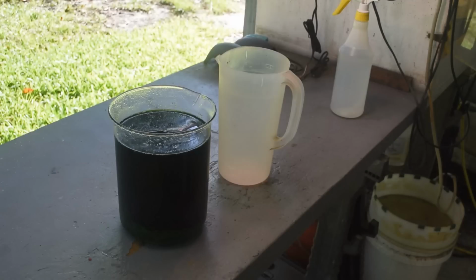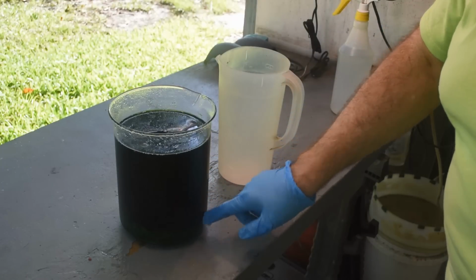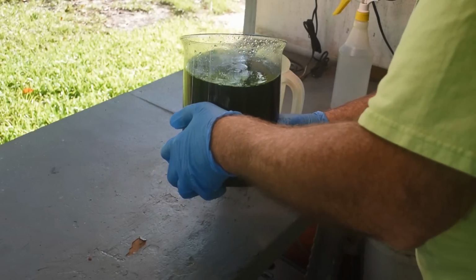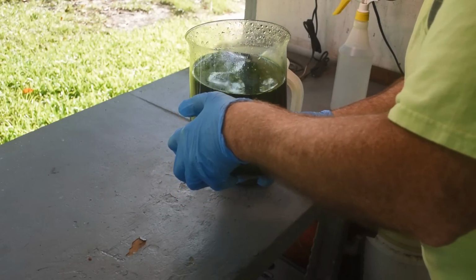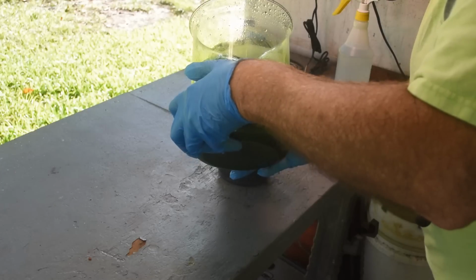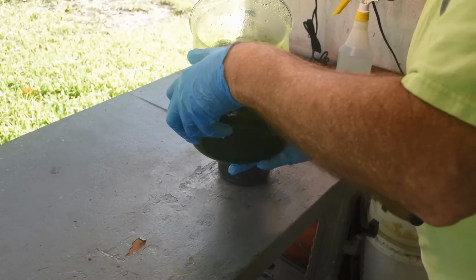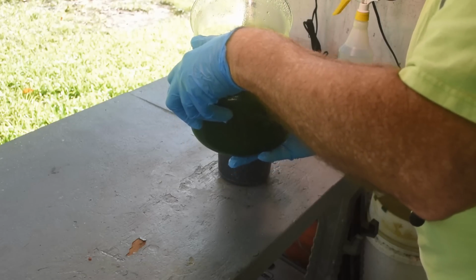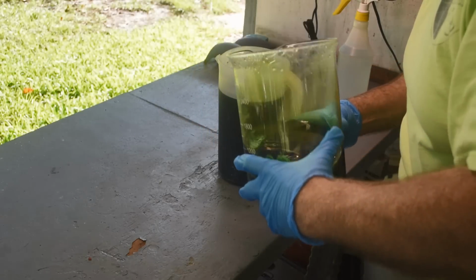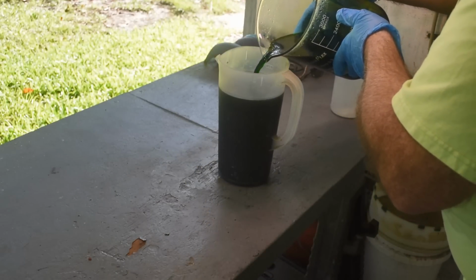All right, so I'm going to do the same thing I did before. I'm going to pour off the liquid and leave what solids are down here behind. We may do a test in a minute. I want to see if this deep green liquid, whoops, spilling some of it, has a lot of palladium in it or not.